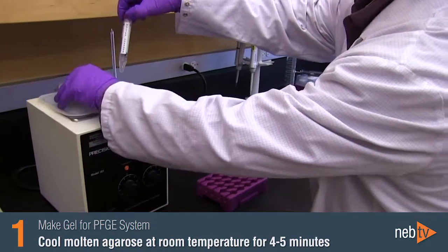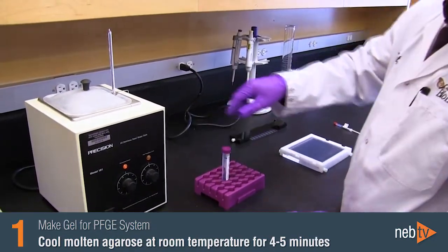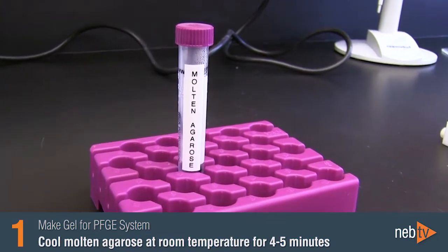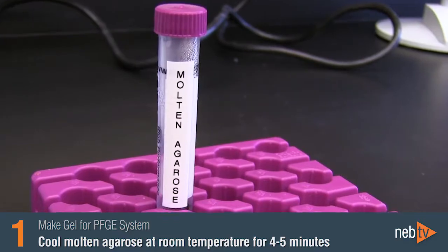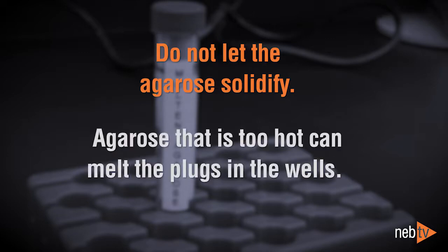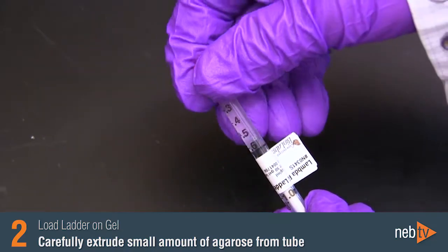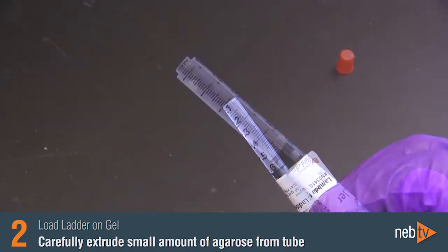Once the gel is solidified, remove the 4 ml aliquot from the water bath and let it cool at room temperature for about 4 to 5 minutes while you load your solid PFG marker plugs into the gel. Do not let the agarose solidify, as you will need this agarose to be in a liquid state to seal the wells. However, it is important that the agarose not be too hot, as it can melt the plugs in the wells.